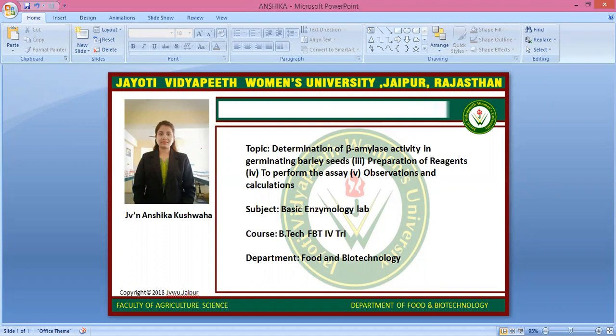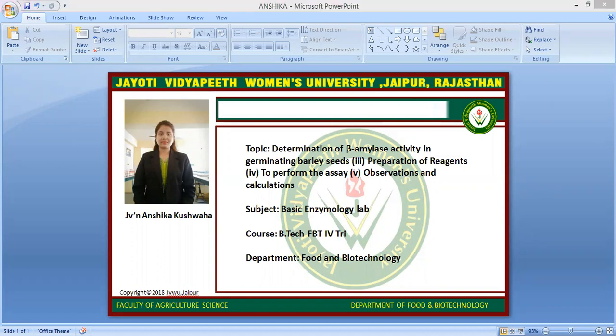First of all, the required materials are: germinating barley seeds, mortar and pestle, beaker, pipette, water bath, starch, iodine, and Benedict's reagent.